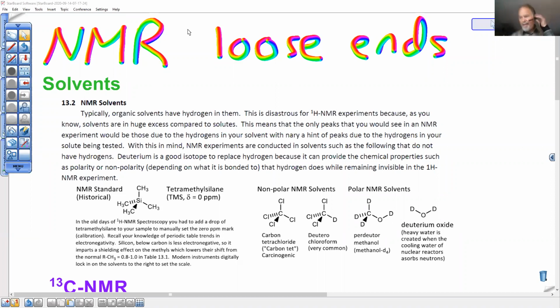All right, everybody, we're back. We only have a short segment here with loose ends in nuclear magnetic resonance. We need to talk about what solvents are appropriate to use in nuclear magnetic resonance experiments.